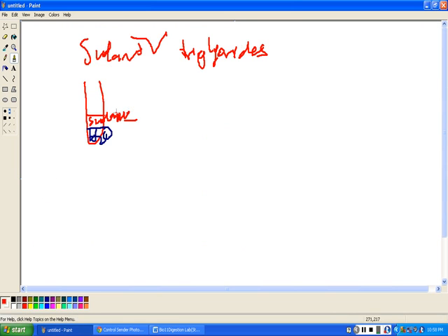Sudan 4 is reddish in color, so you're going to see that the ones that have triglycerides in them will stick, and it will cause that to change reddish in color. Even though we're adding Sudan in water, it's going to cause the water to be reddish in color as well. But you'll notice that when we looked at this, it was very transparent, translucent, so we could actually see through it.